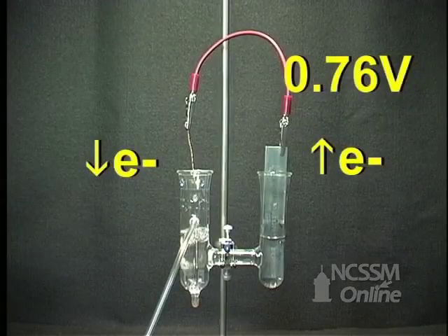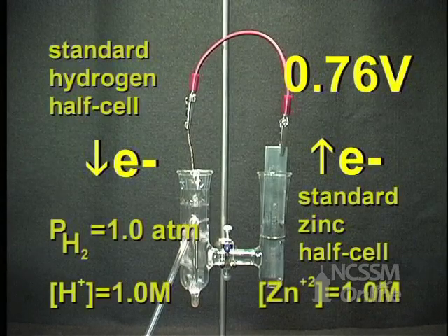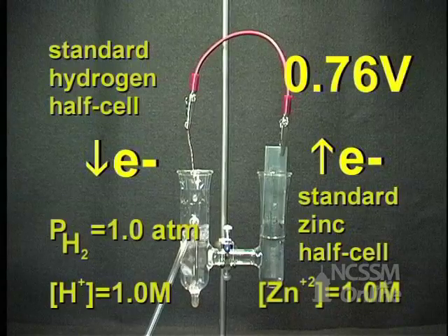In order to assign a voltage to a standard half cell, we attach the half cell to a standard hydrogen electrode. Here we have a standard zinc half cell attached to a standard hydrogen half cell.